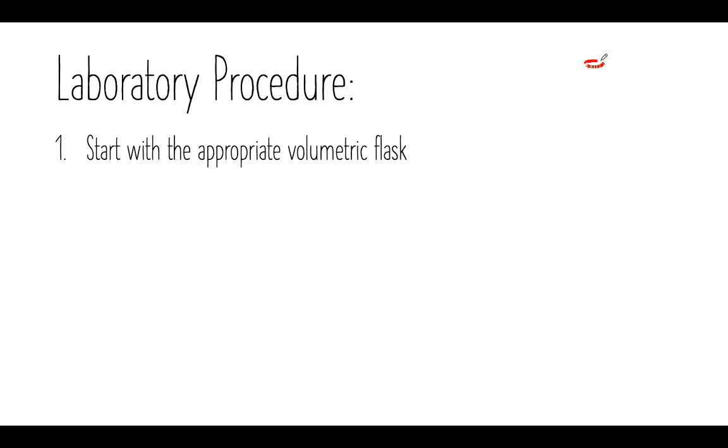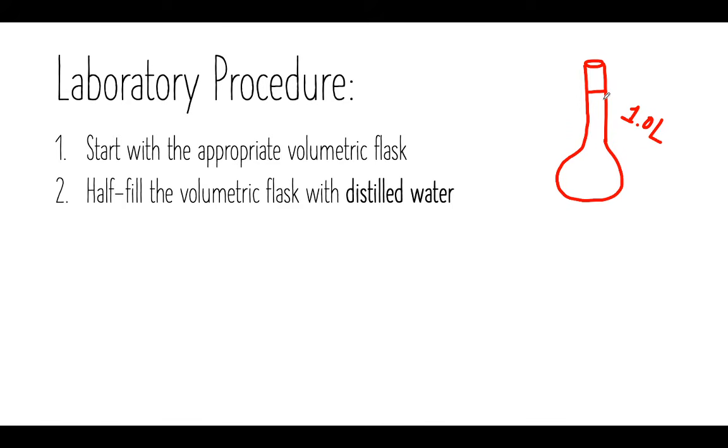Because they want us to create a 1 liter solution, it would be convenient for us to use a 1 liter volumetric flask. So I'm going to, again, attempt to draw a volumetric flask here. And I'm going to draw that line, that exact line that tells me that this fills up to 1 liter of my solution.